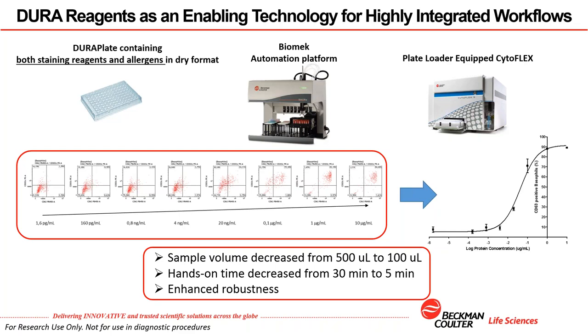Doing so, we have fully ready-to-use plates that simply need to be put on an automation platform, such as the Biomek NXP in that case. After the routine has been performed by the Biomek without intervention from the user, the plate can simply be brought to and analyzed on a flow cytometer equipped with a plate loader. In that case, that was a CytoFLEX.